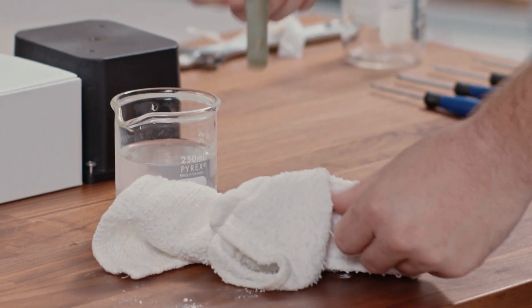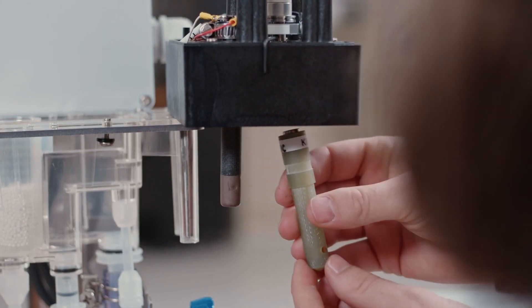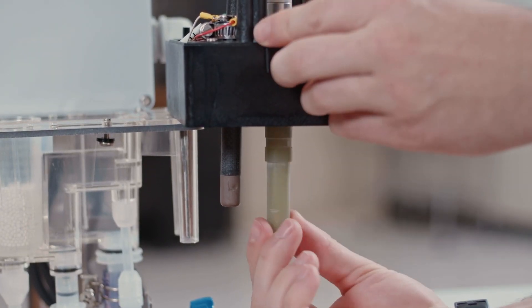With the electrode polished and rinsed, we can then reinstall it back onto the analyzer. To replace it, you do the same process of removing it in reverse.